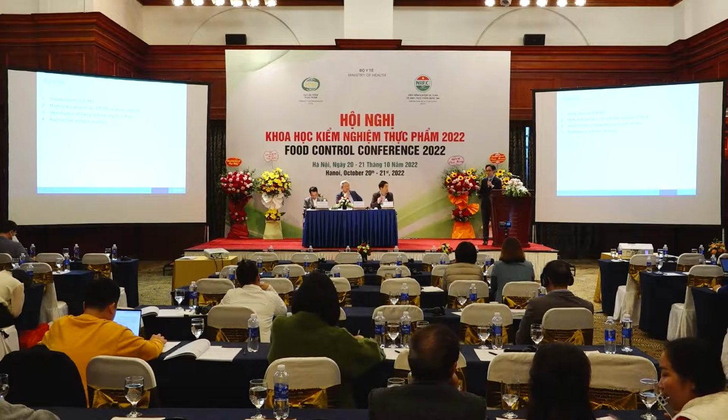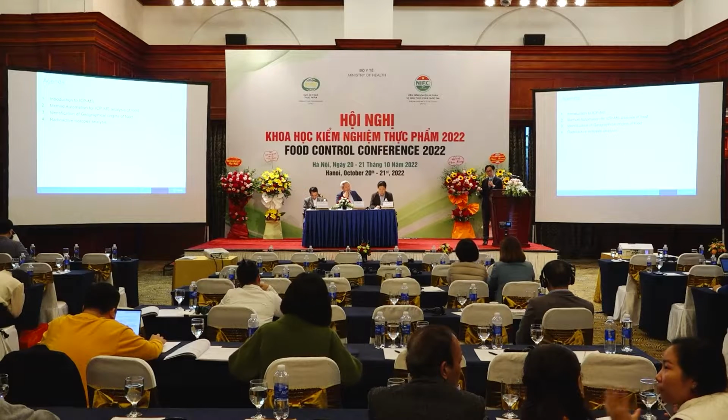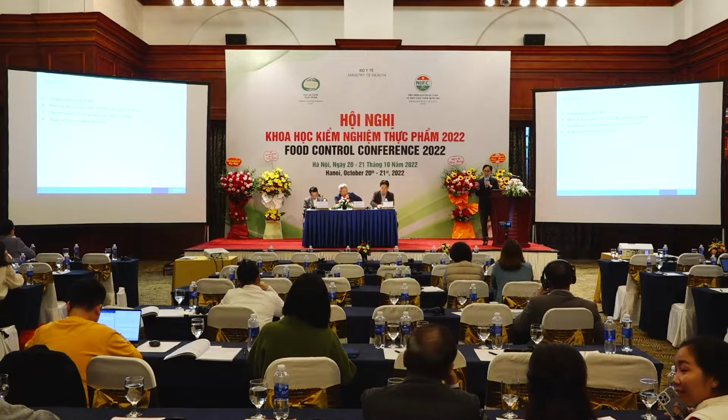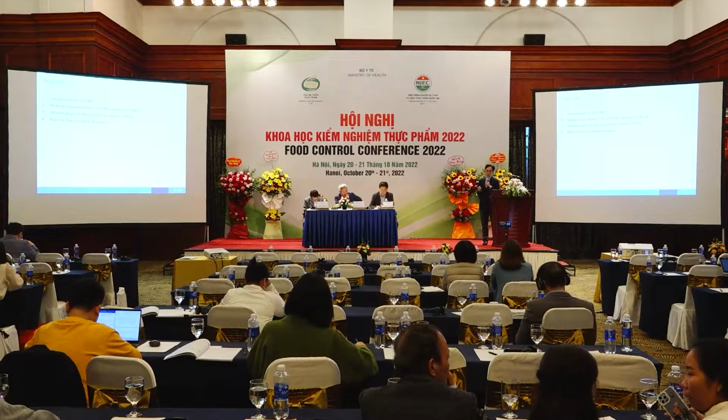I will give a quick introduction to what ICPMS is, maybe a very short one because I'm sure there's a lot of experts here on the floor. I will run through three types of applications that we do on our ICPMS.